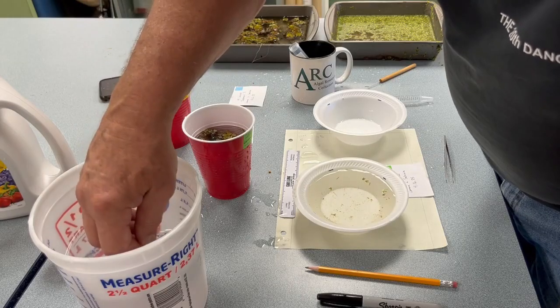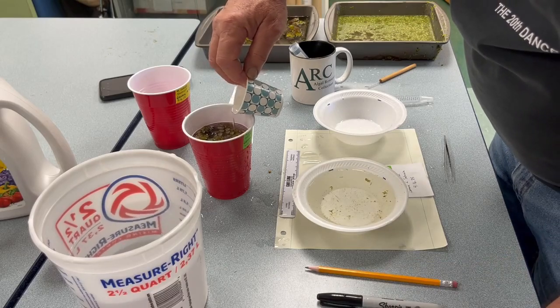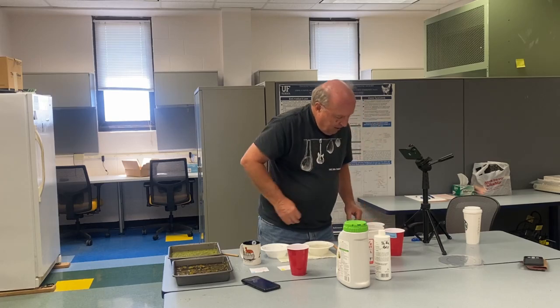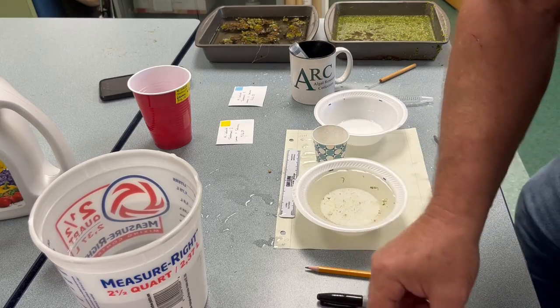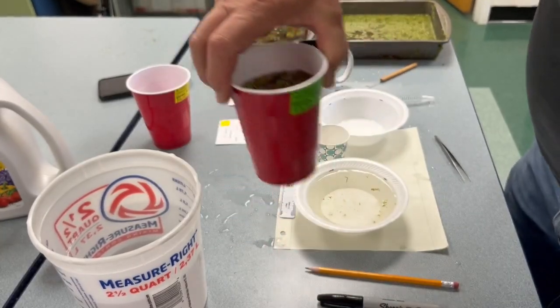And then we add a little water to get to this ridge line, the last ridge line on the Solo cup. You can see that it's mostly Salvinia with a little bit of Lemna, and then there is some clear water. Technically about 20% of it should be open. Yeah, we already had this pre-labeled. Okay, and so we're done with that one.